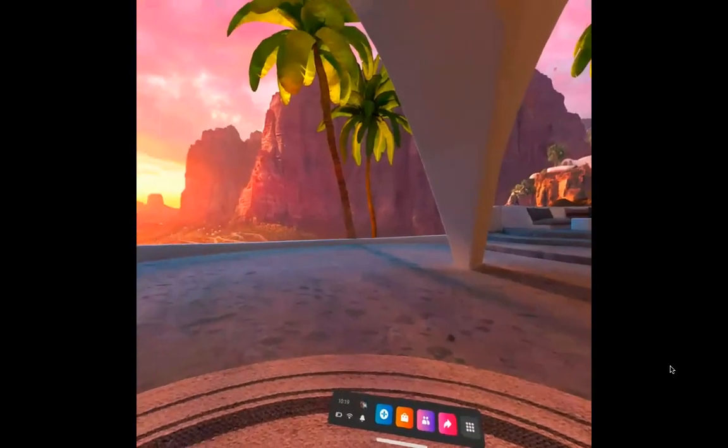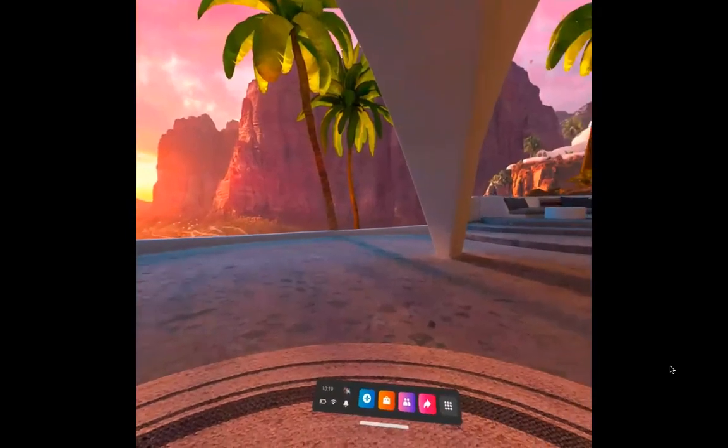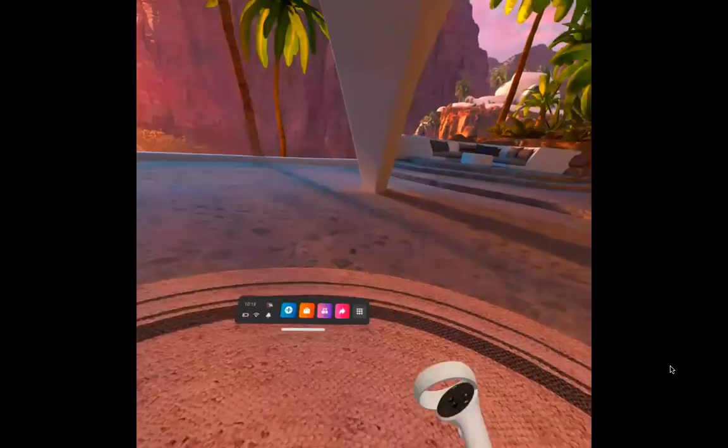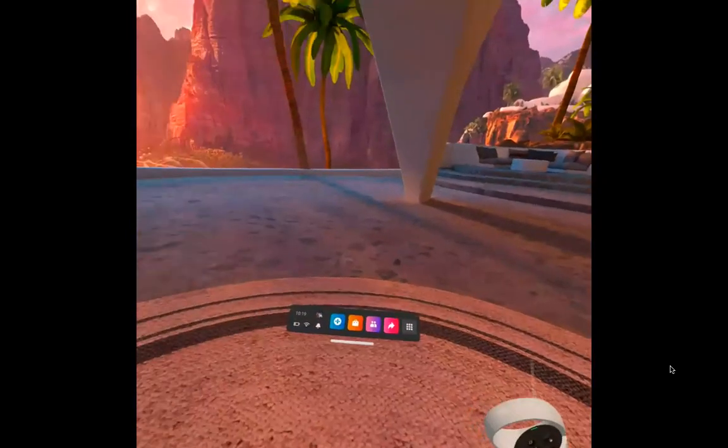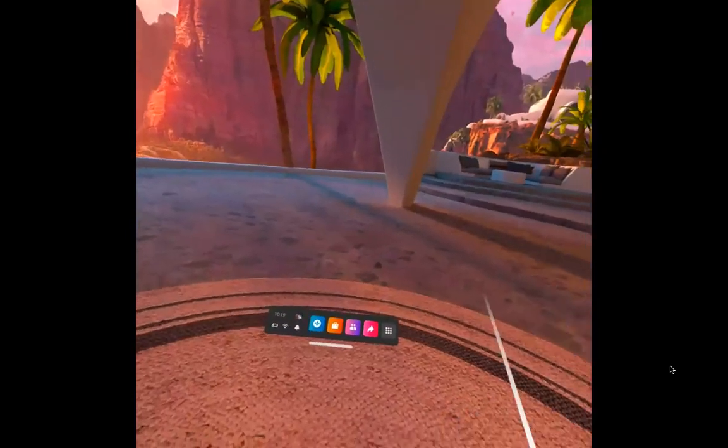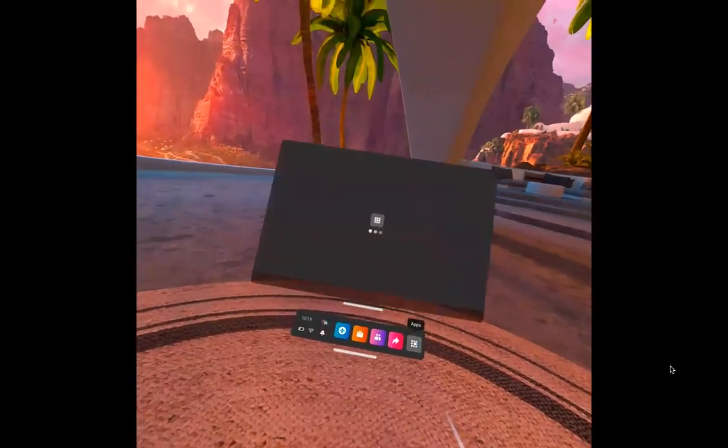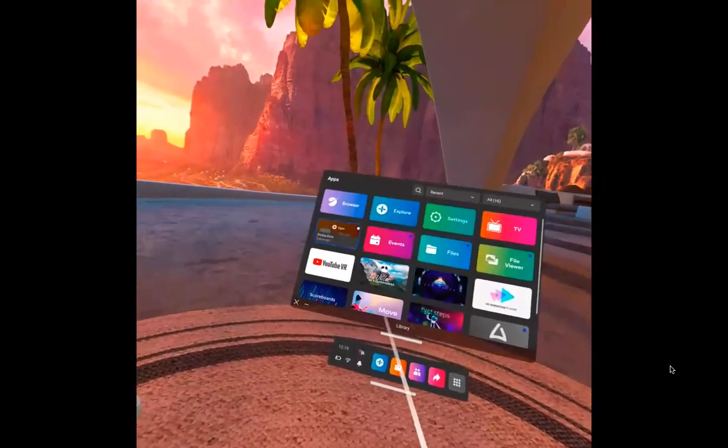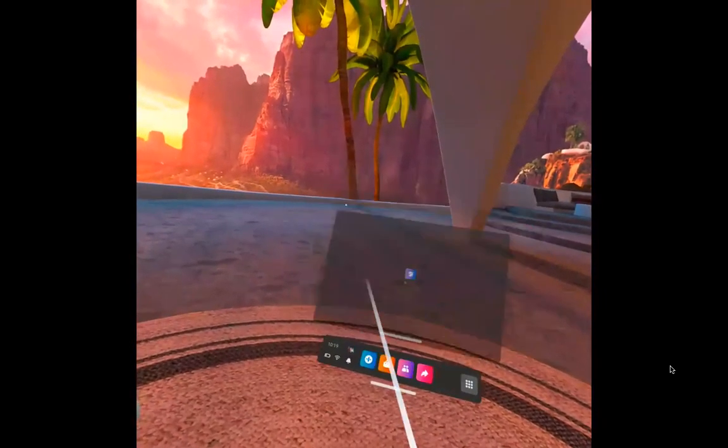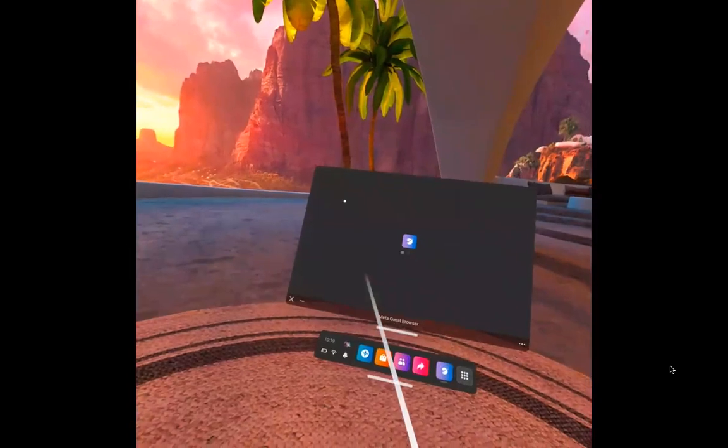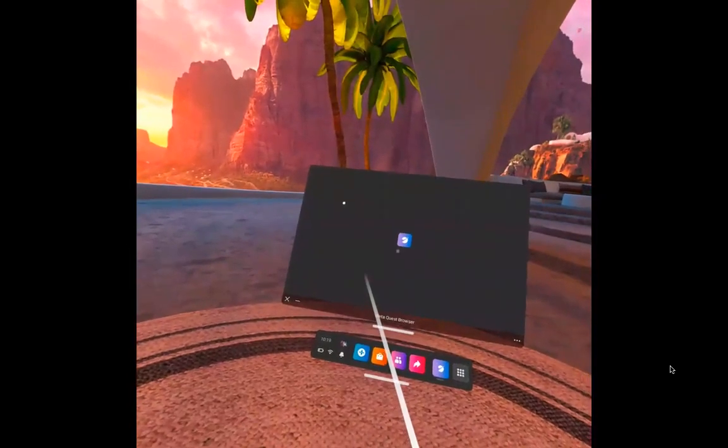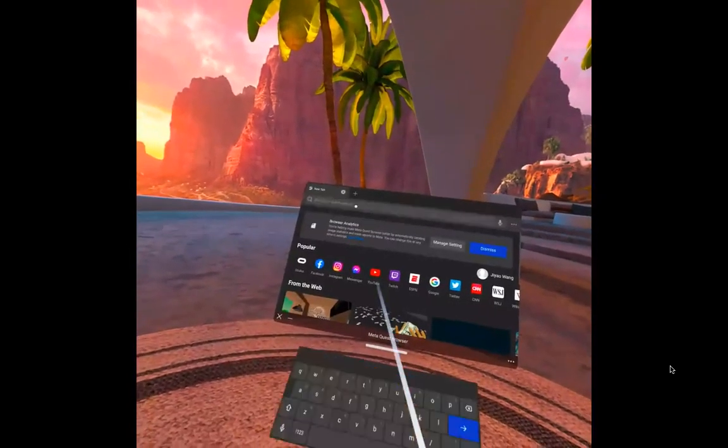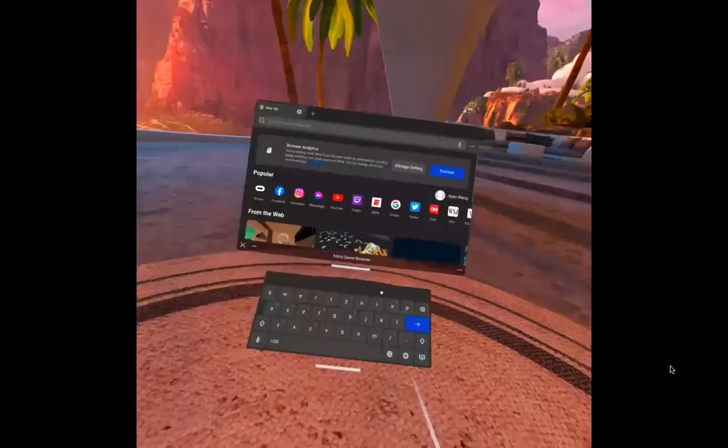First, I'm going to talk about virtual reality, VR. Once you have a headset, you can click apps, go to browsers, and search for iCN3D.